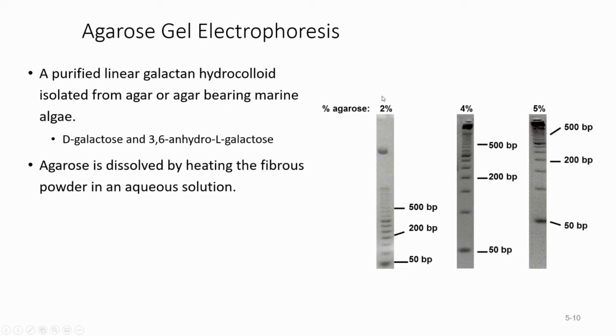And for the lower concentration, Marina, yes. You said for the 2% gel that it separates faster, there's more of a pull? For 2%, because the pore size is bigger, all the DNA fragments can penetrate through faster, all right? And so it's difficult to distinguish them. The resolution is bad. For example, 50 to 200 is poor resolution. For higher concentration, it's more restricted, then you can see the resolution is higher for the smaller DNA fragments. Do you see the difference, right?